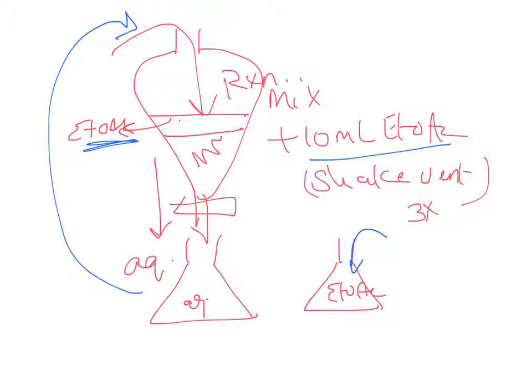Subject that to a desiccant—magnesium sulfate is our desiccant. Add pinches of MgSO4, approximately 500 milligrams—you don't have to weigh it. Add, swirl, add, swirl until some product sticks at the bottom and some moves with the movement. Transfer that into a pre-weighed round bottom flask and rotary evaporate. Your ethyl acetate will be removed and what remains will be your product. Take a mass to determine the percentage yield.